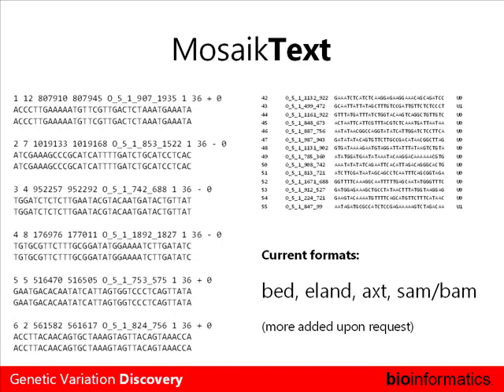Yes? It's going to visualize the SNP in the coverage. So this is way before we even bother looking for SNPs. So no, we don't have that right now. But we do have that in our visualization tools.